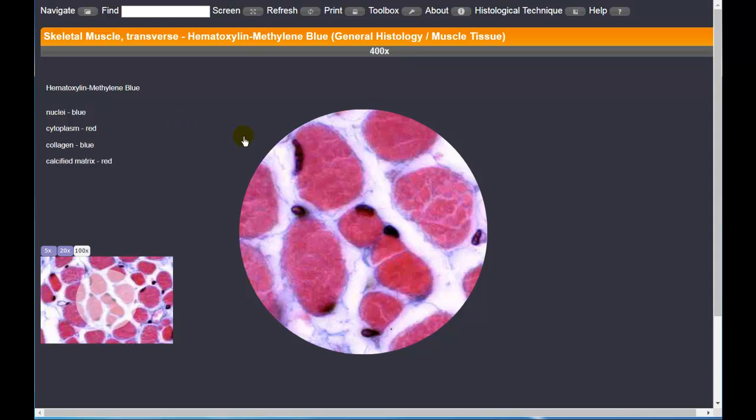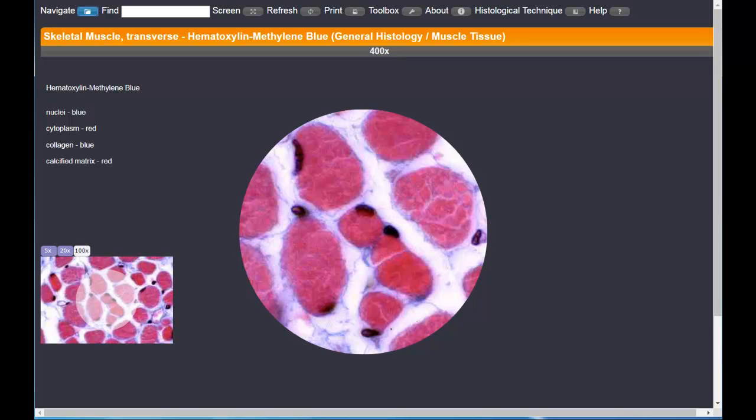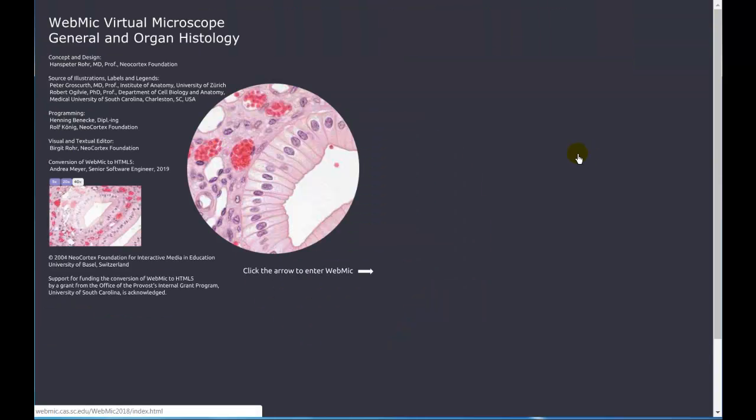So I think that about wraps it up, and I'm going to go back to the navigation and close that window, and then we'll go back to the actual starter page. And I trust that this video has helped orient you to the use of WebMic.